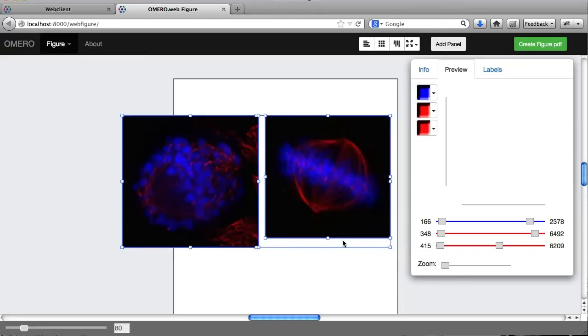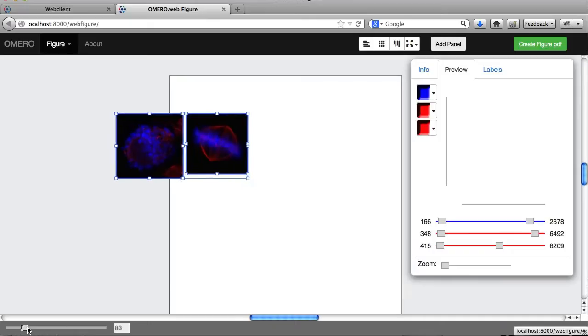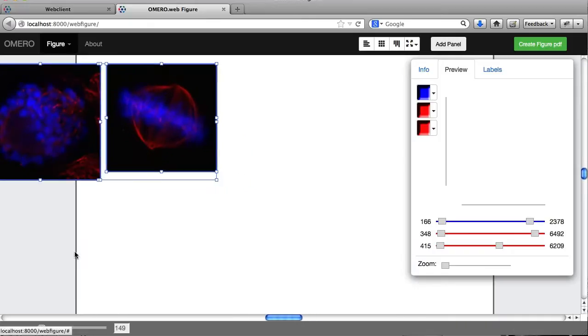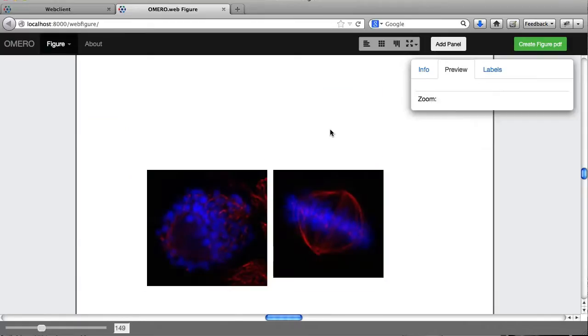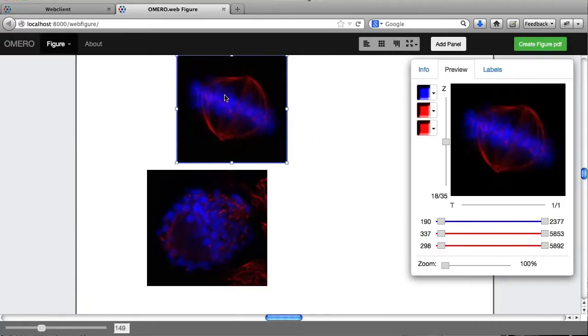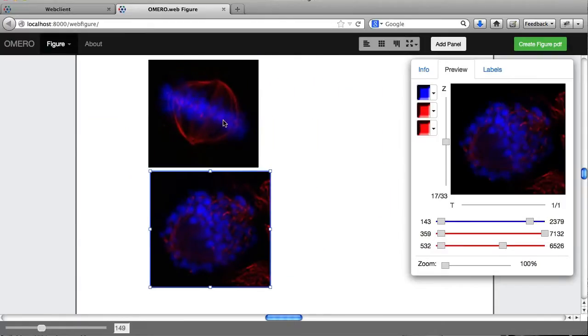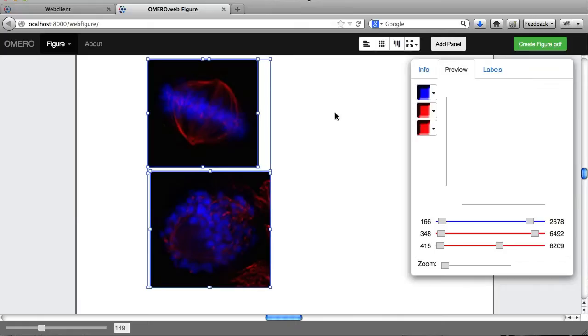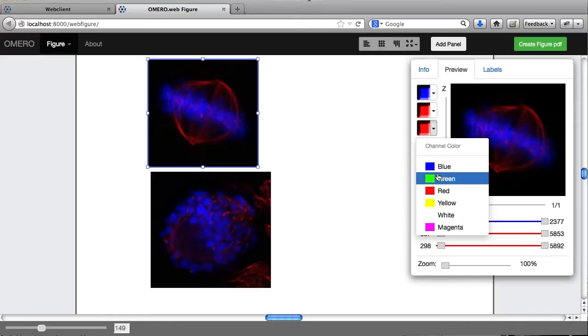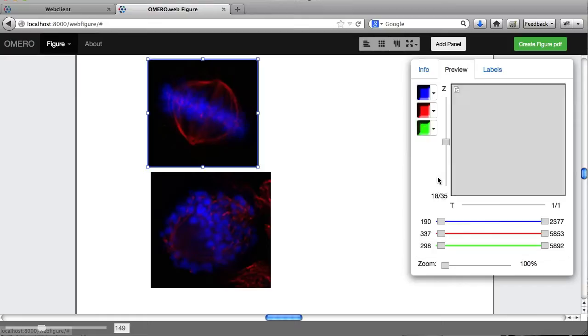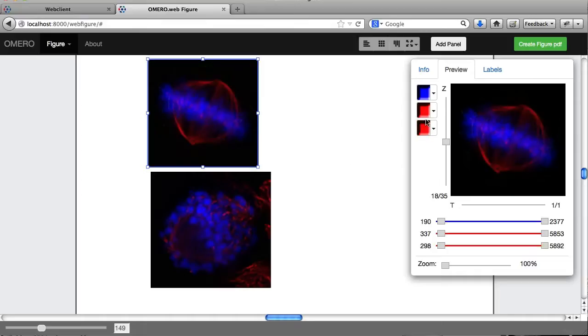I can move them around and resize them. And the first thing I'm going to do is play with the rendering settings. Let's select both of them, actually. And I need to change some of the colors here. So if I show you what it looks like with an individual image, I can choose different colors. Let's undo that.